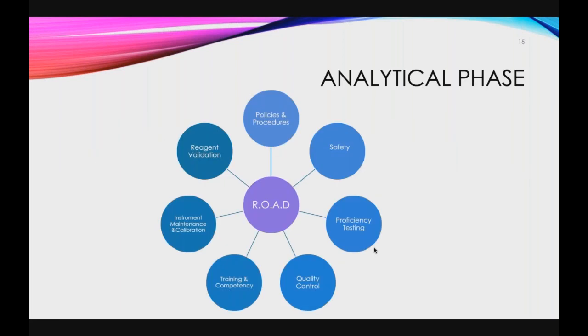And then that is the pre-analytical phase. So we're going to move on to the next phase, which is the analytical phase. As you can see, there is a lot of material to cover and a lot that goes into this section of the inspection. We will use the R.O.A.D theory for each of these topics. And what we'll do is we'll go first into policies and procedures, and we'll talk about what they would read, what they would observe, what they would ask, what they would discover. And we'll go through each one of these areas, covering the most important parts of it.